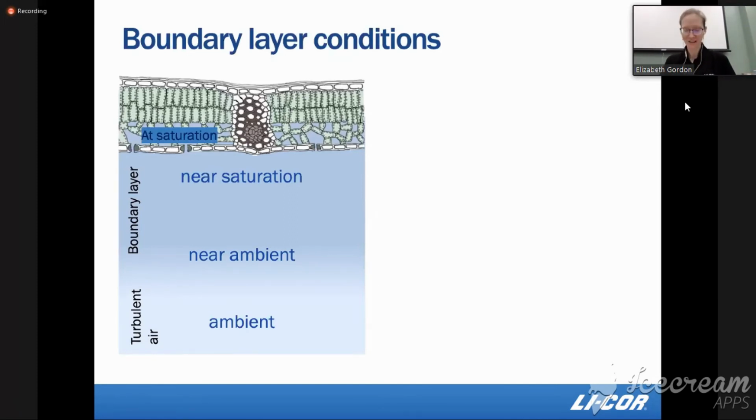Specifically, the thing that tends to affect stomatal conductance and thus CI is boundary layer conditions. Even in a leaf that is normally in the desert, the air around it might be very dry, to our perception 20 to 30% RH. So dry. Around the leaf, though, there's always a layer of highly humidified, saturated air. That allows the leaf to make sure that it's kind of safe. It's a little coat for it. But that boundary layer of saturated air is very difficult for us to measure, because of the amount of water preventing the CO2 from getting there.